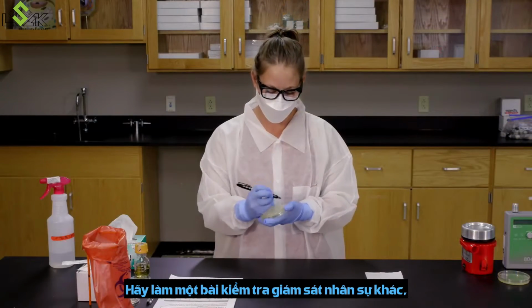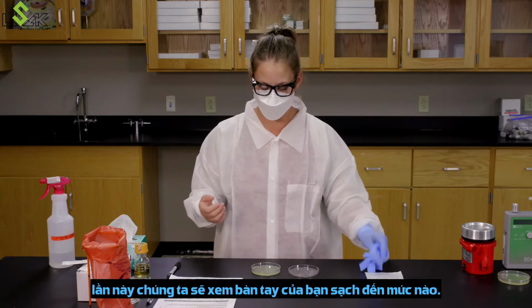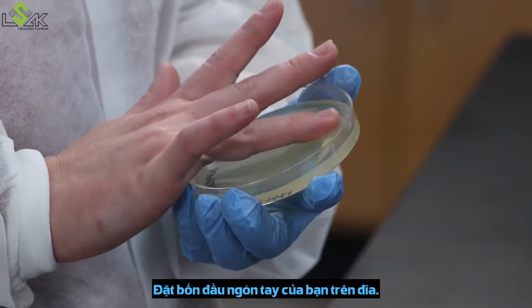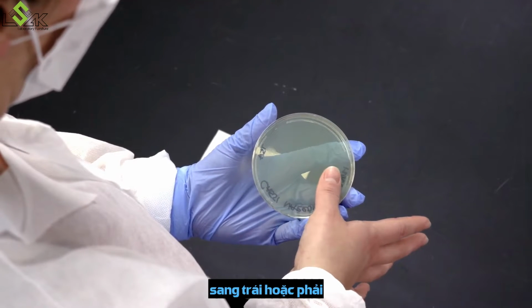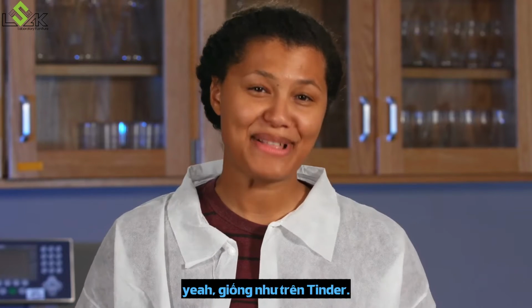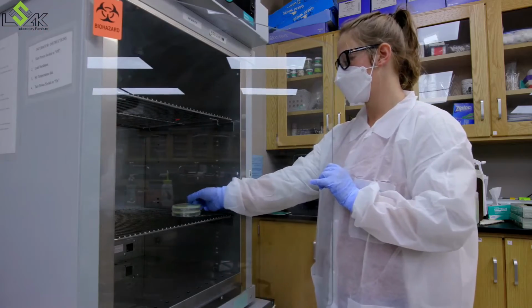Let's do another personnel monitoring test. This time we'll see how clean your hands are. Place your 4 fingertips on the plate and swipe your thumb across the surface, to the left or right. Yeah, like on Tinder. Cover and incubate this plate too.